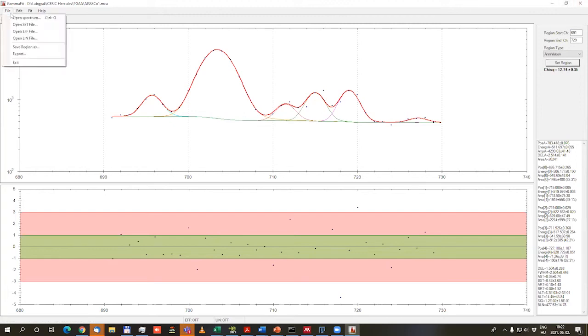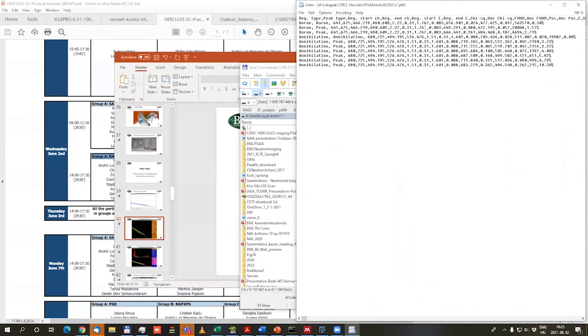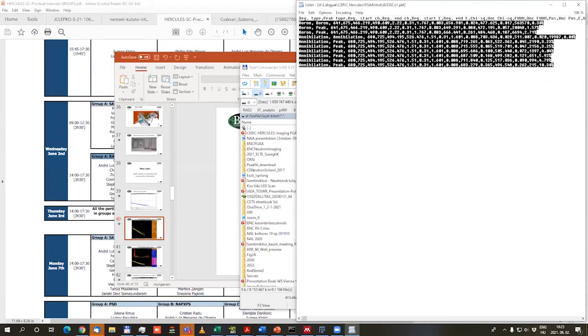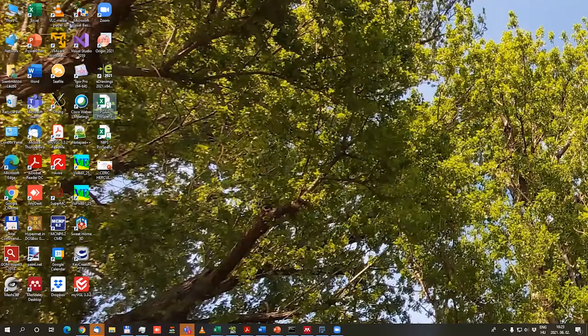And we can create a so-called PKF file from this utility, which is a kind of a table again, and it contains the same set of information as the PKL file. And once all these things are done, then we can proceed to the concentration calculation stage, where we have an Excel utility called Prospero.